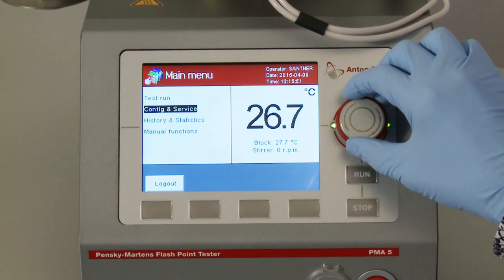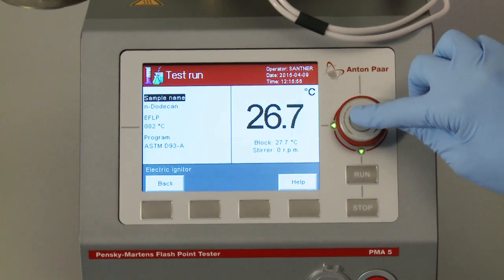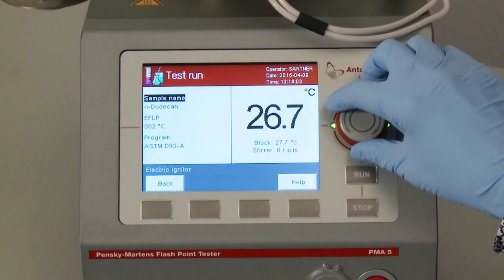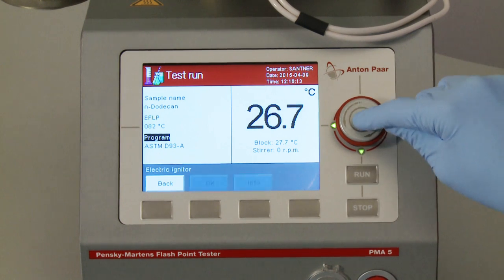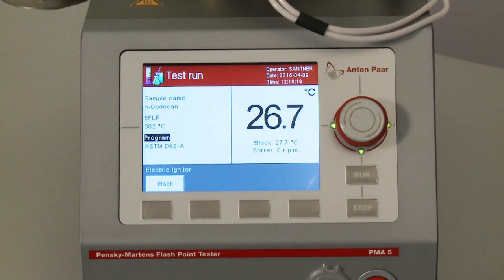Turn the jog shuttle to test run and press enter. Now enter the sample name, the expected flashpoint, or EFLP, and then choose a program — for example, the ASTM standard program. After entering all parameters, press the soft key run on PMA5 to start the test procedure.